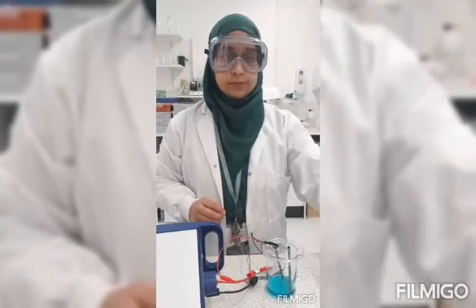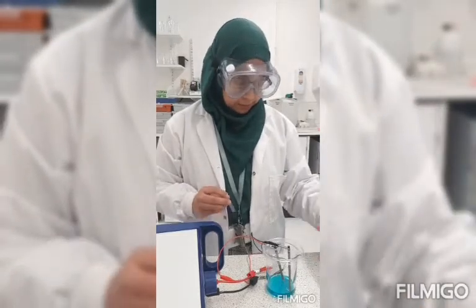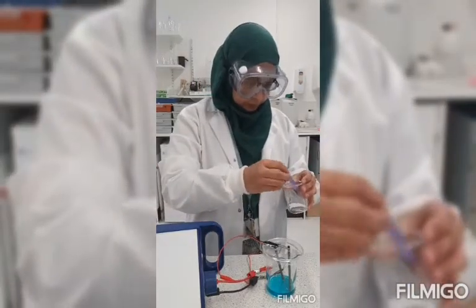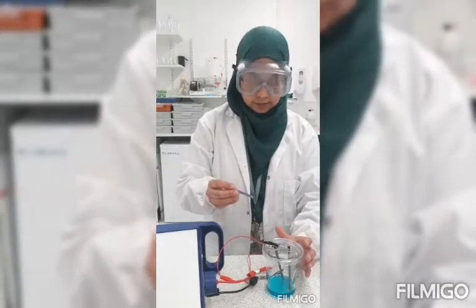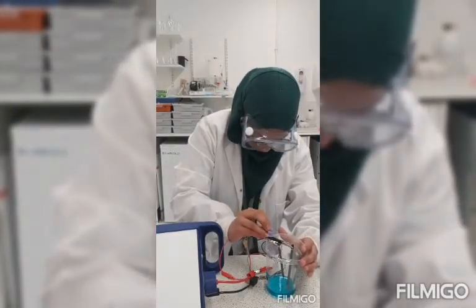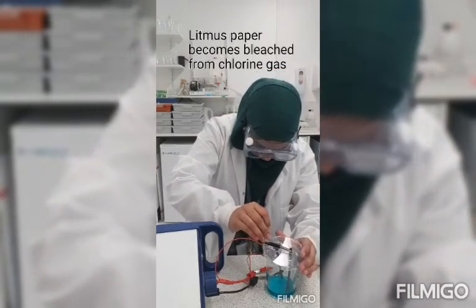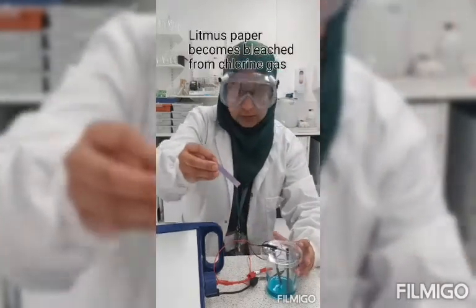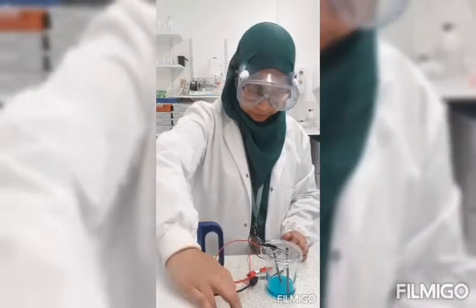What I'm going to do now is using some blue litmus paper, which needs to be damp. I'm going to put that near the gas being produced. It should turn a bleach colour like this. This indicates that chlorine is being produced.